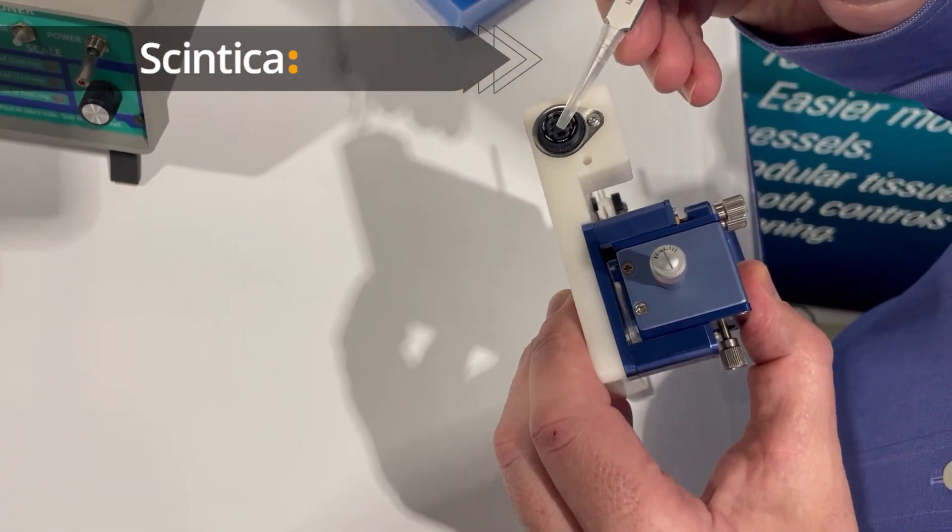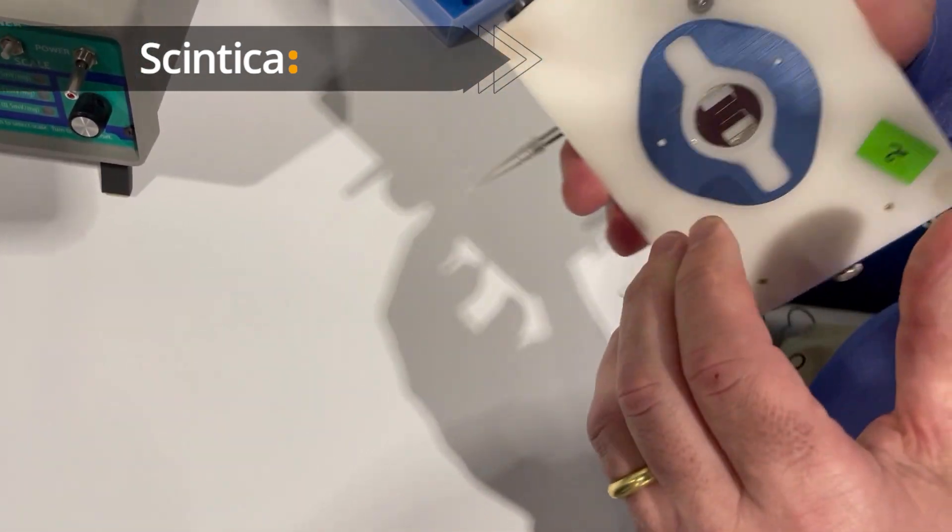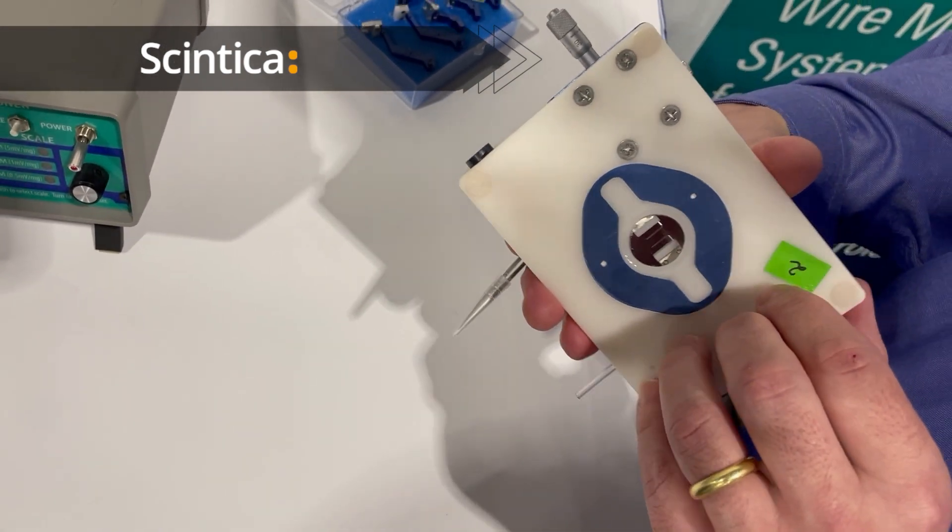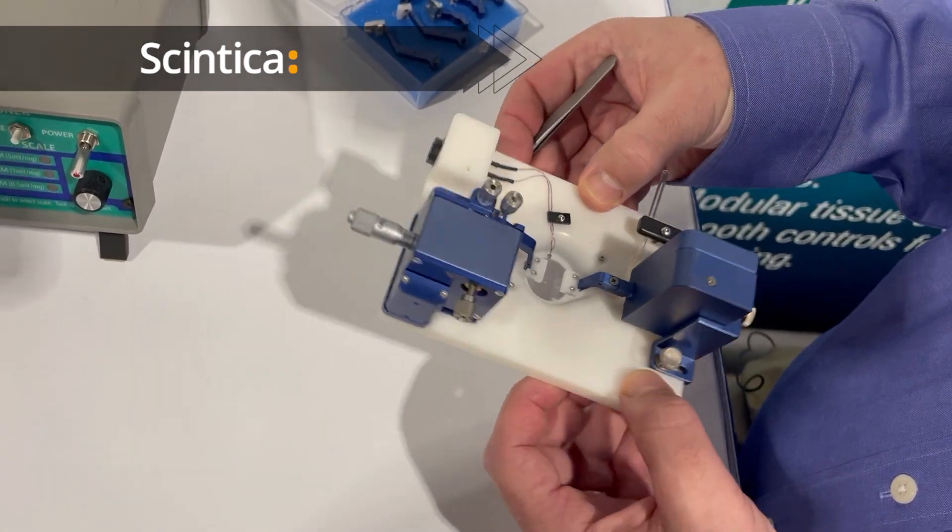A temperature sensor connected and interfaced to our temperature controller for regulating the bath temperature in stagnant bath applications.